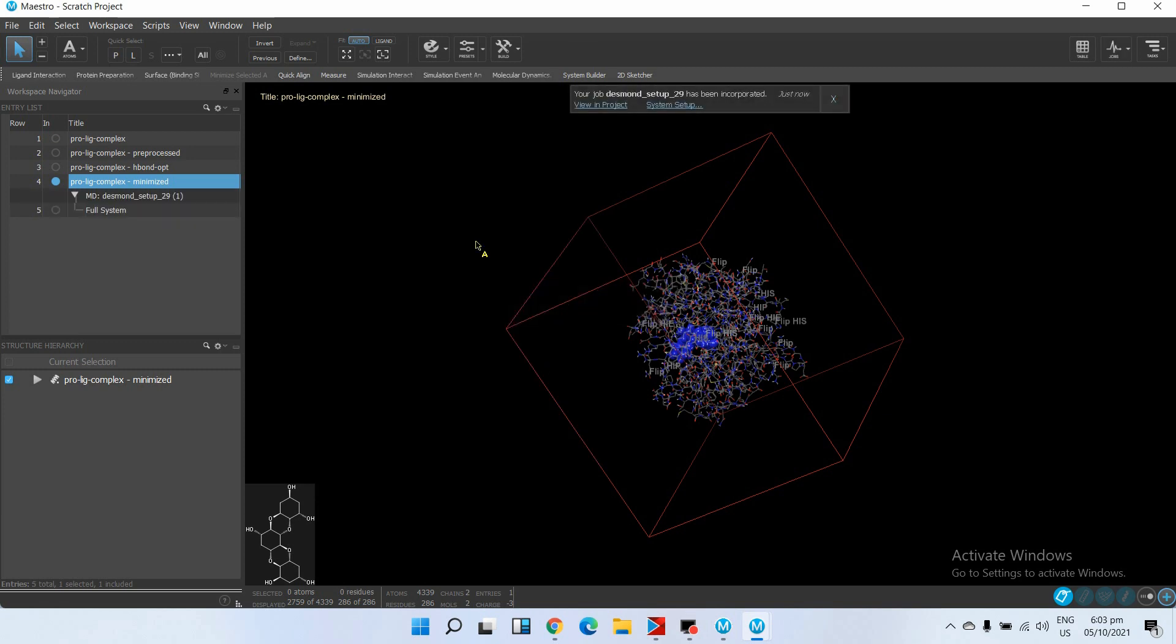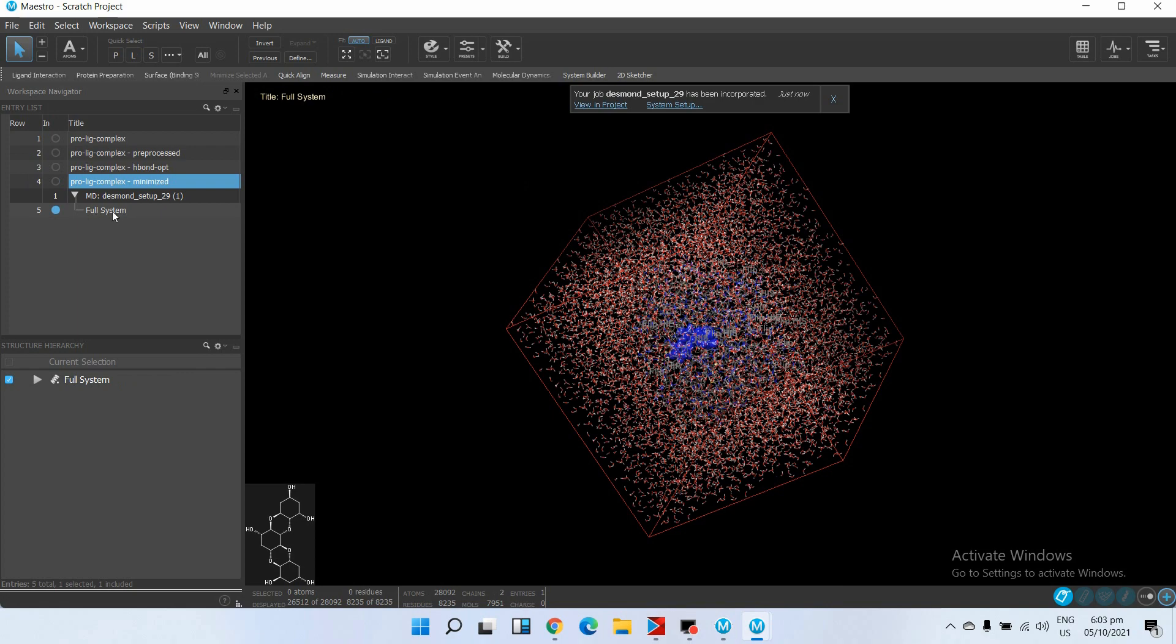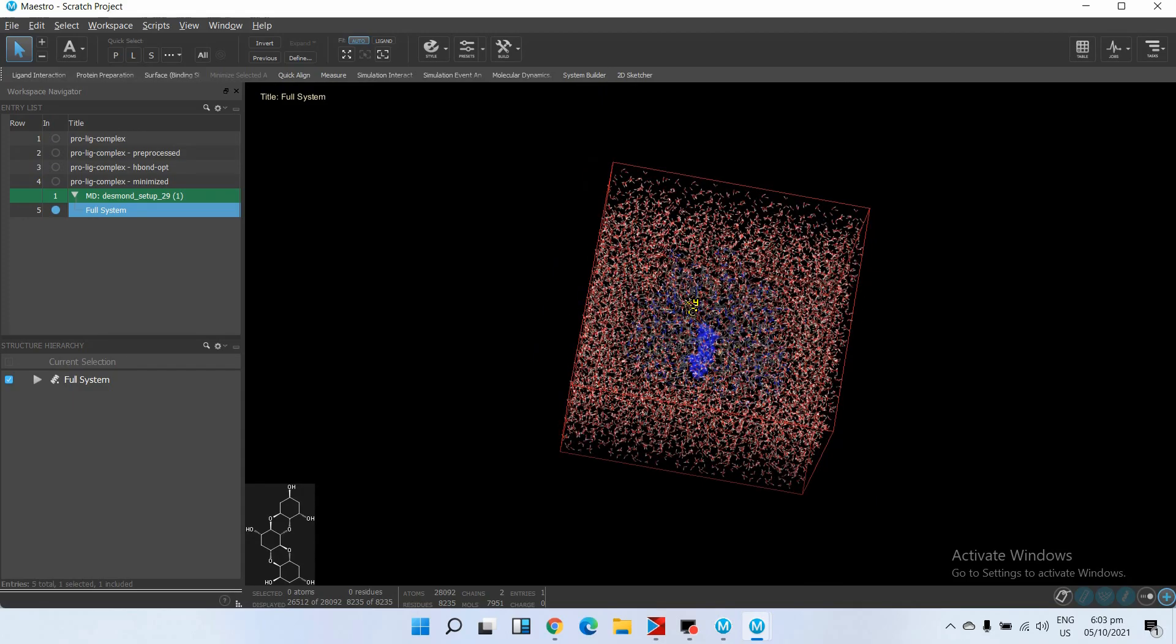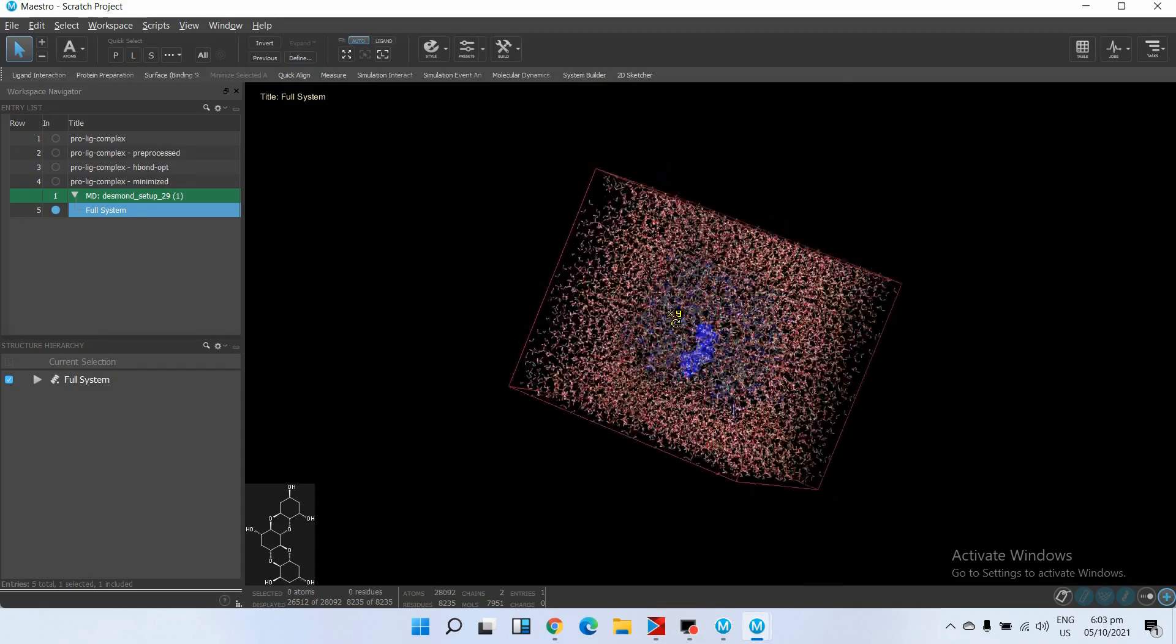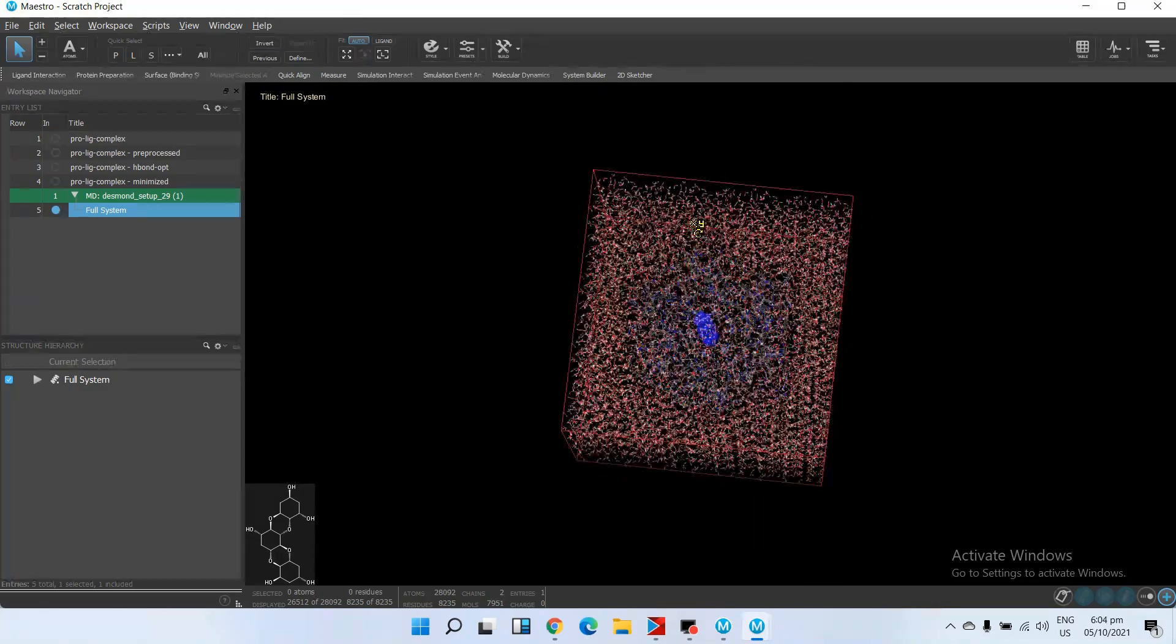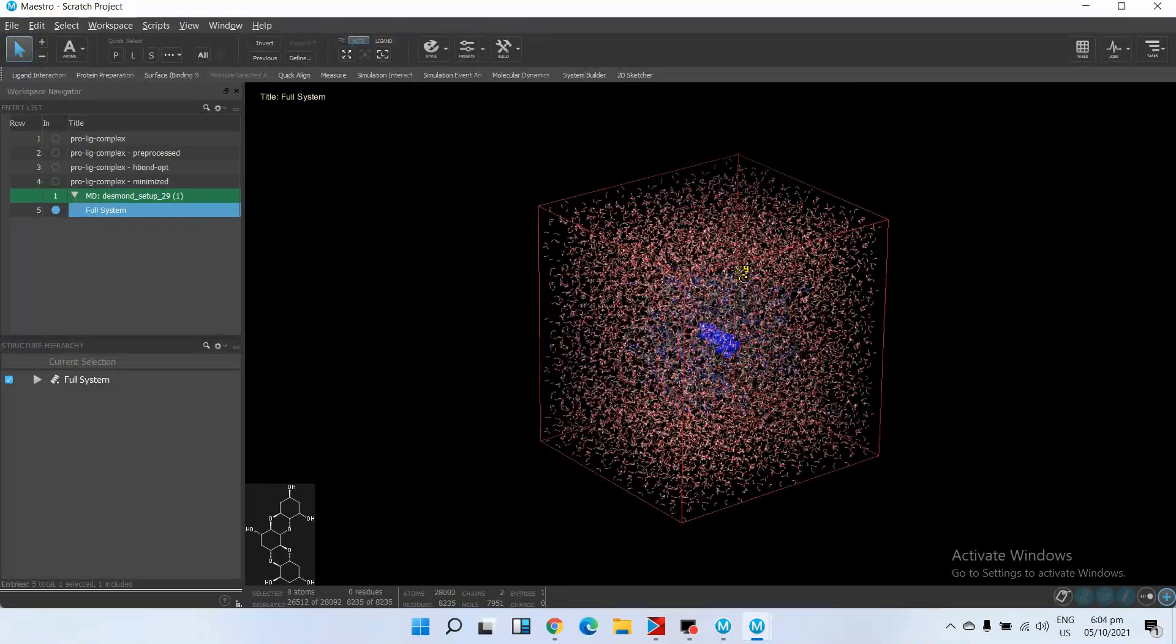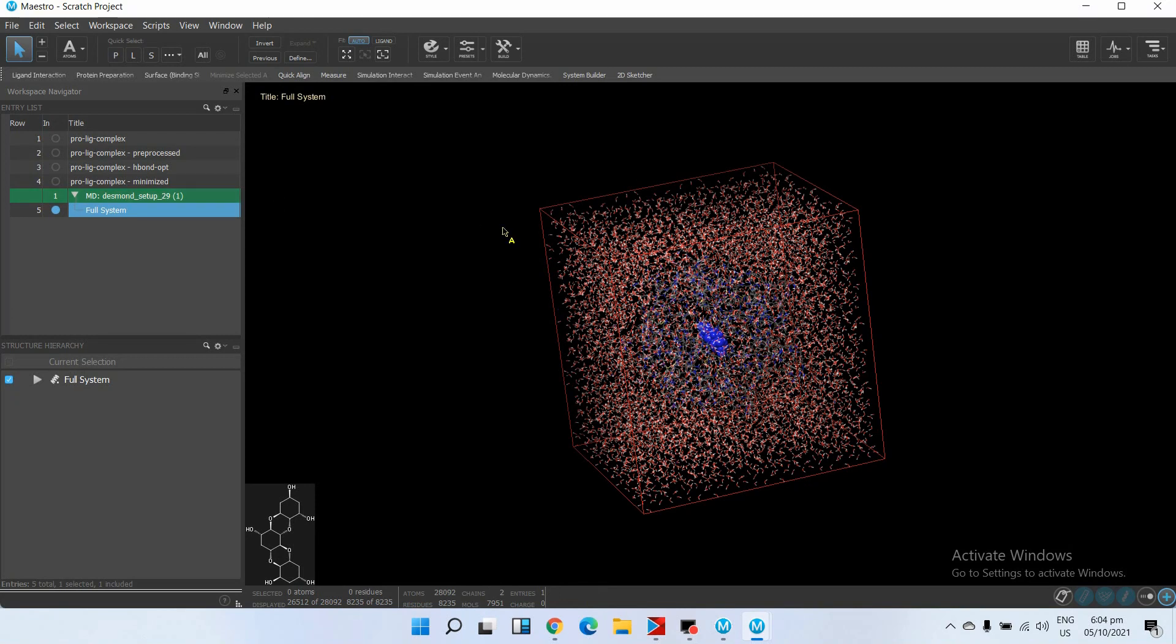Our job is incorporated. Click on the full system. You see the grid box is created around our protein and ligand. Now we will save this complex.